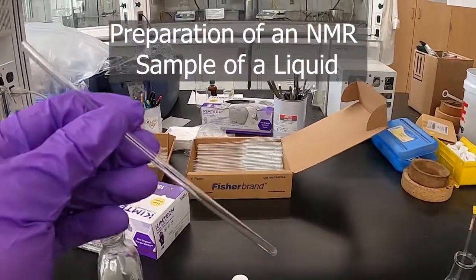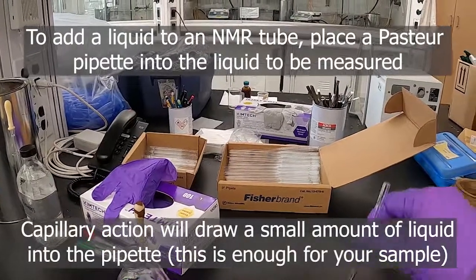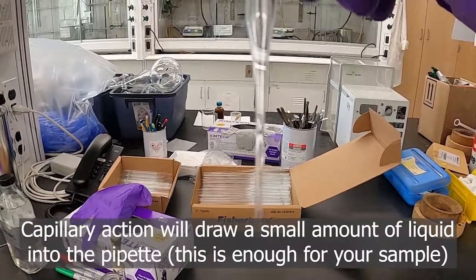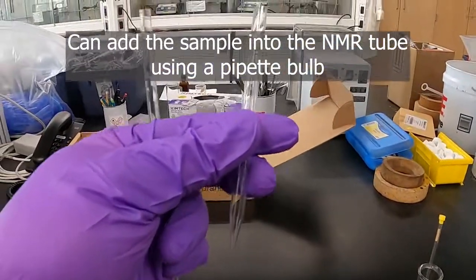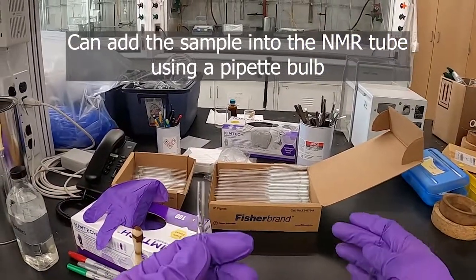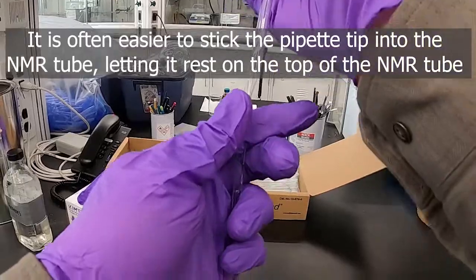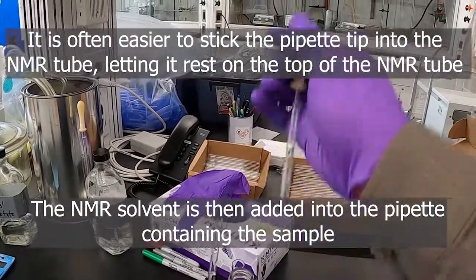Another method for making an NMR sample, especially one that's in liquid, is using a pipette. Just the tip of a pipette — dip it in the liquid that you're going to use, and you can see the tip of the pipette fills up a little bit. Maybe the lower half inch, about one centimeter of the pipette tip is full. You could put a pipette bulb on the end and shoot it out. Put it in the tube and try to put the pipette bulb on. Then we've got our liquid in there and we can add our NMR solvent.